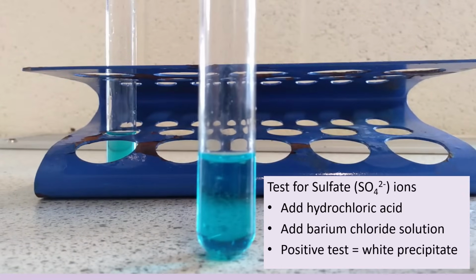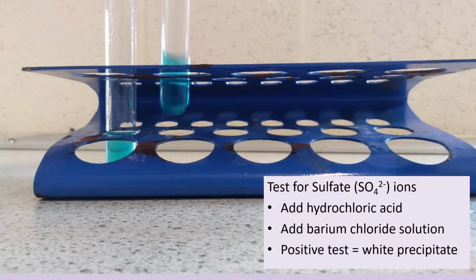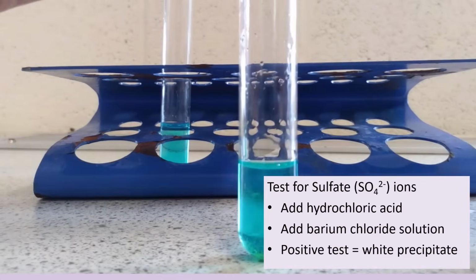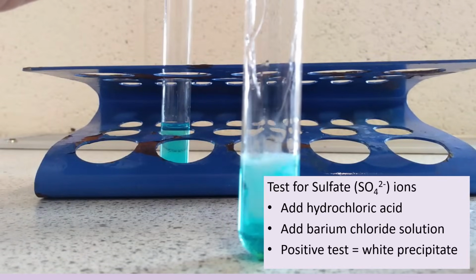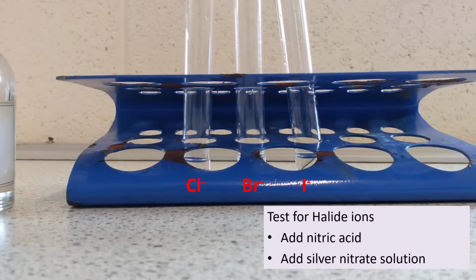So if I add some to this tube, not a lot happening, no sulfate ions there. But if I add some to this tube, then I can see that white precipitate forming. So again, this is a two-part test.